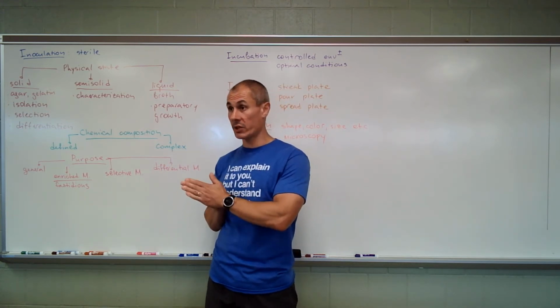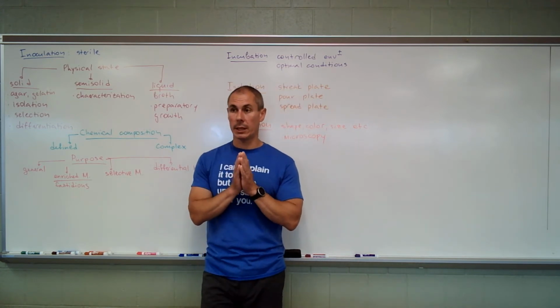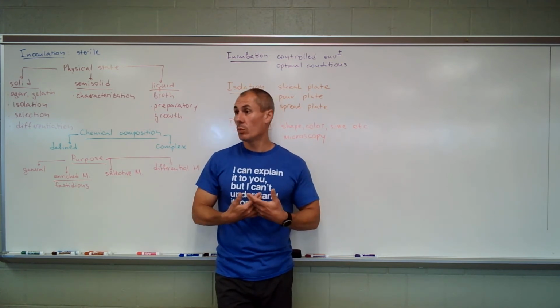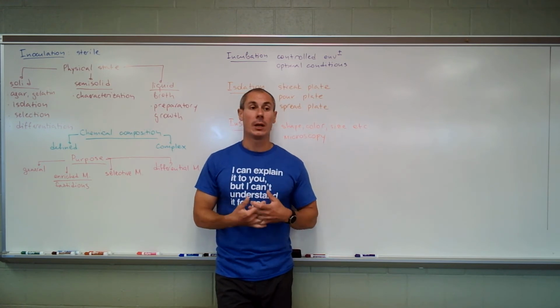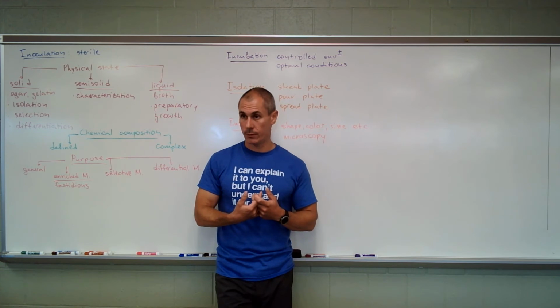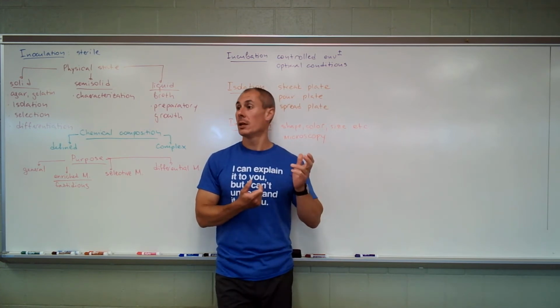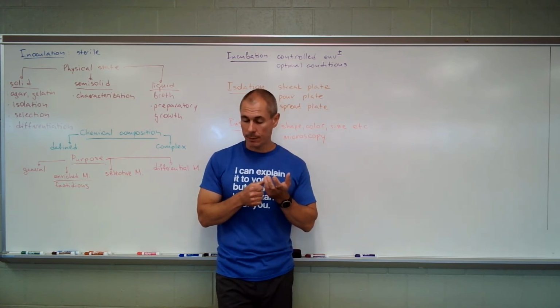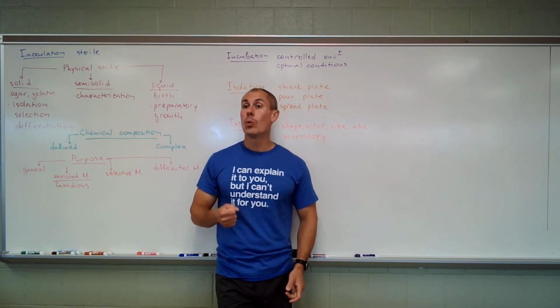We're not doing staining today, but I want to go over microscopy. This is not something that I can do a better job than the table in the lecture notes. So let me explain. There are 7 types of microscopy in the lecture notes. Bright field, dark field, phase contrast, differential interference contrast, fluorescent, confocal, and 2-photon microscopy. What do you need to know?